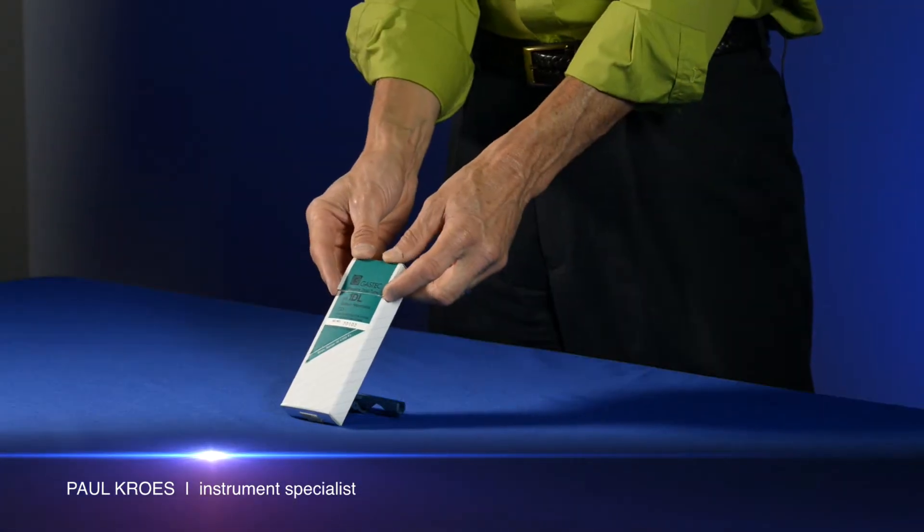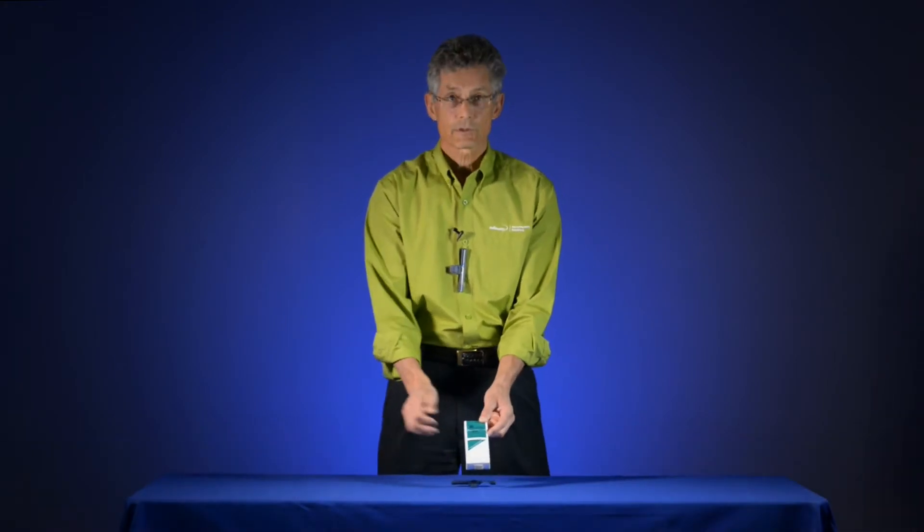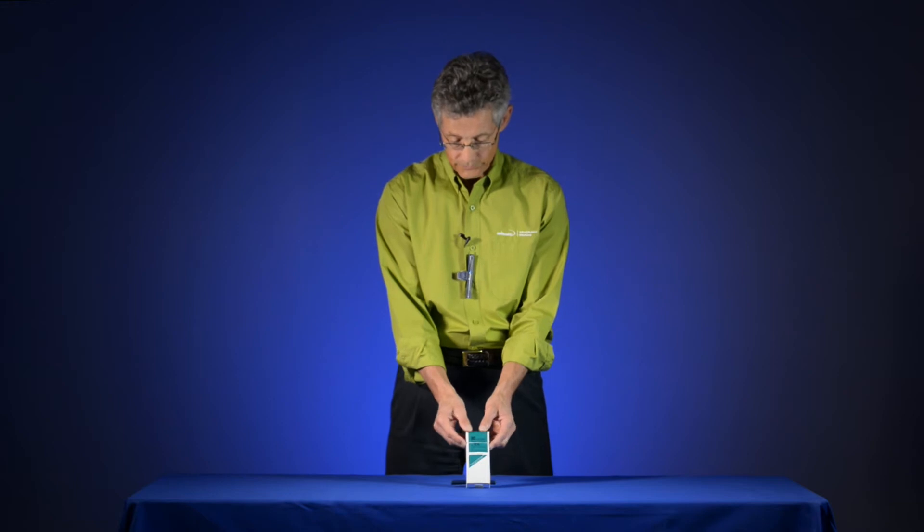So we use DOSI tubes because they are an inexpensive, easy way to measure the average concentration of a target gas over a period of time.